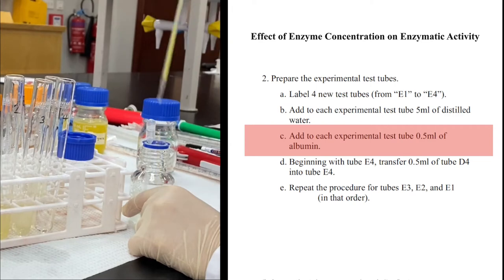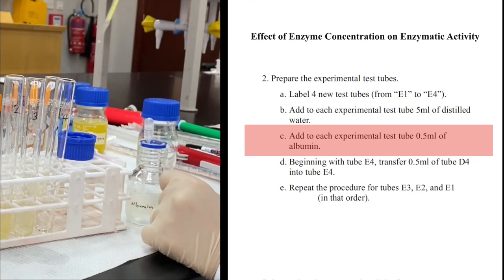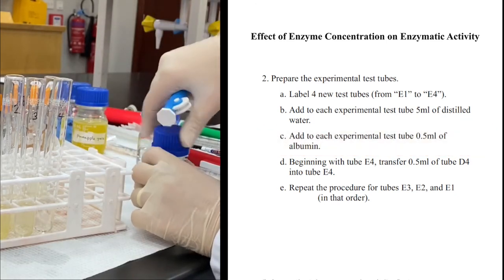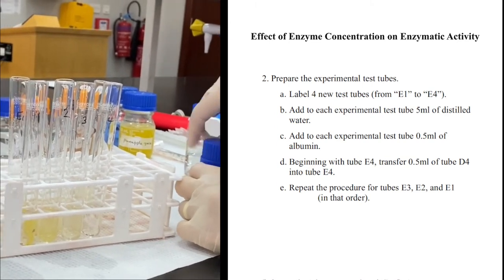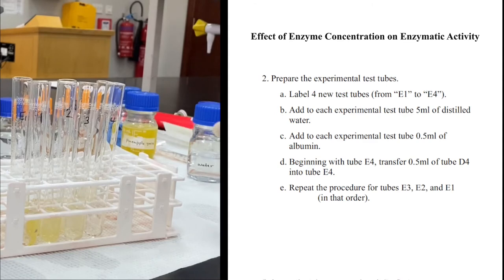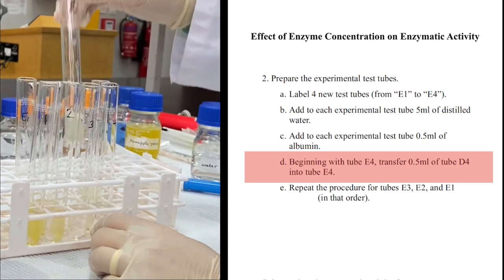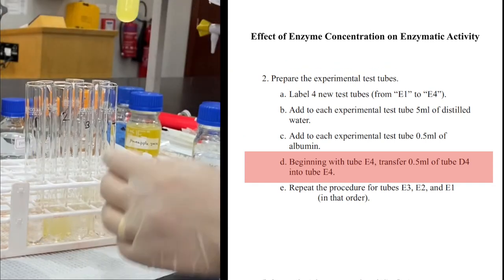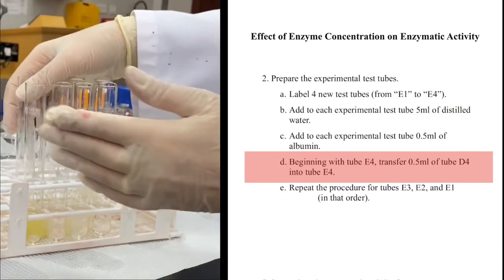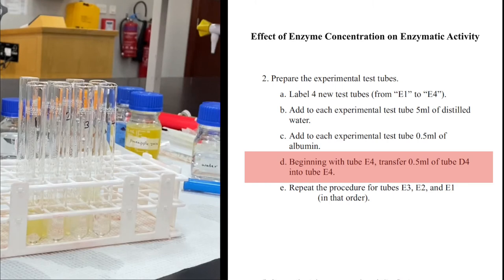After the addition of the substrate, we will add the enzyme. Albumin is the substrate, and I will add the enzyme in different concentrations because I have different dilutions. If I want to use the same pipette, I need to start from the most diluted enzyme and work toward the least diluted — because if I dip the pipette in the most concentrated tube first, it will pick up too much enzyme and contaminate the next tube.